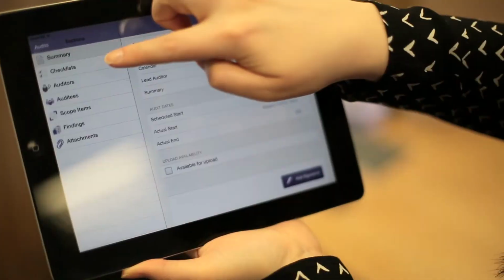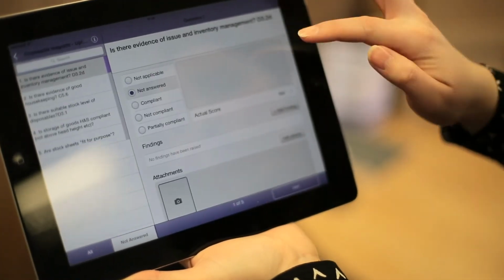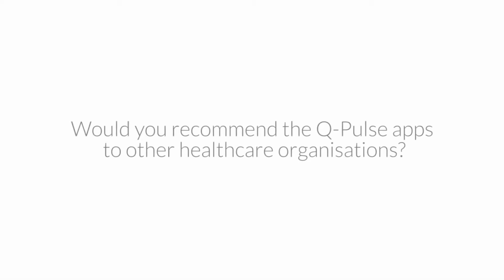We're very busy, and as we become more and more automated, there's more auto validation, more verification done by PC. So it means that if people have got the iPads for Qpulse, they can just use the iPad quickly, find the bit of information they need, and then be able to move and leave the PCs available for the more concentrated validation, result verification duties.